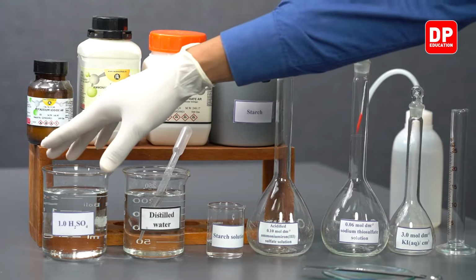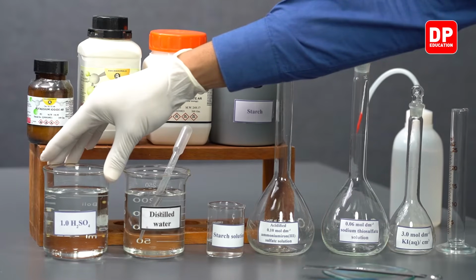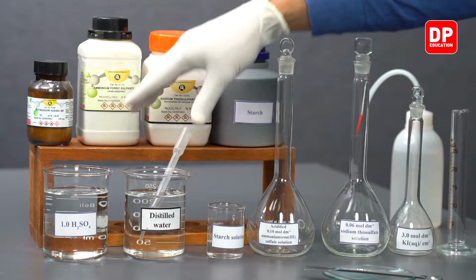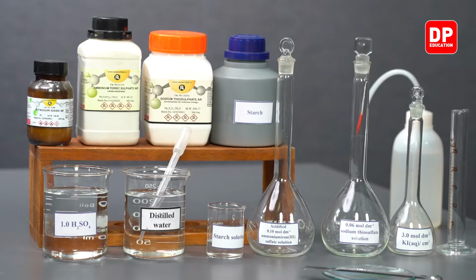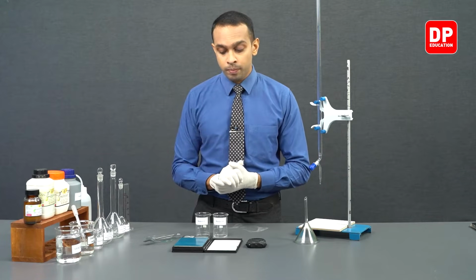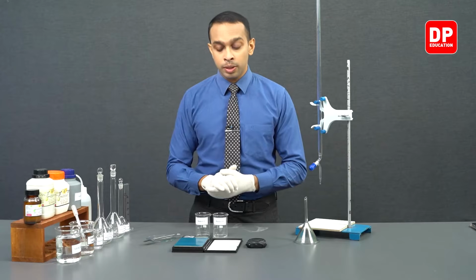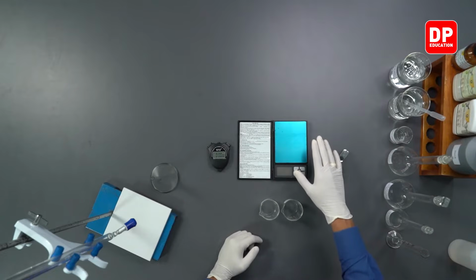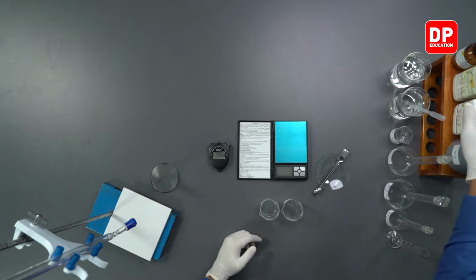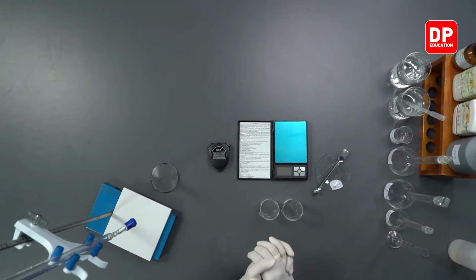Apart from that, we'll be using 1 mol per decimeter cubed sulfuric acid and distilled water. As equipment, we'll be using volumetric flasks to prepare the solutions we need for this experiment. We'll be using a digital balance to weigh the correct masses of the solids we need to prepare the solutions.